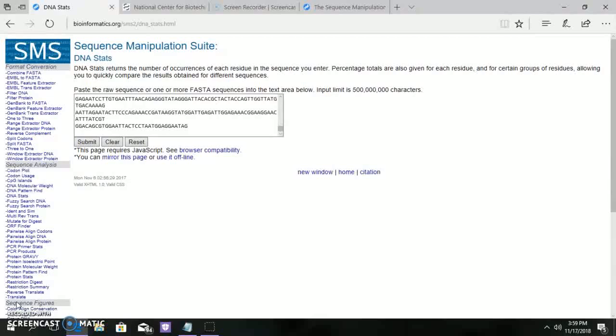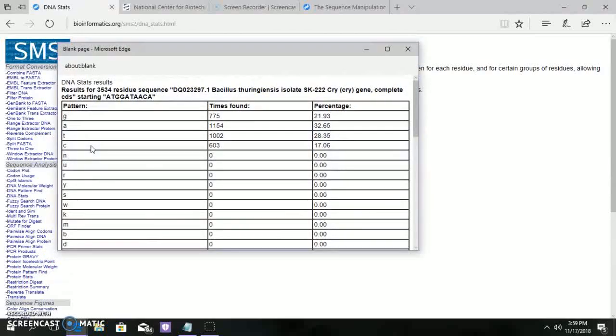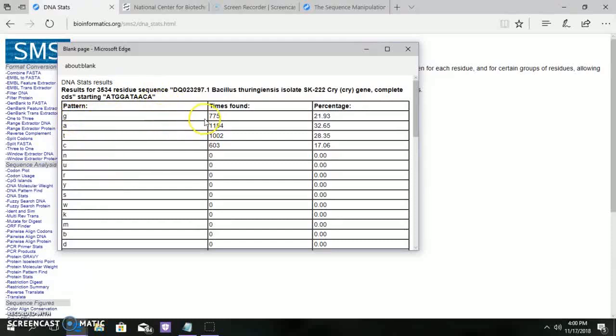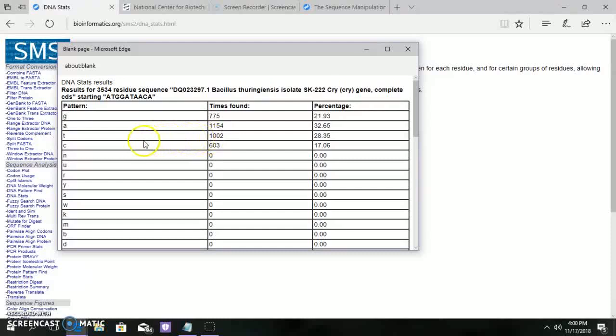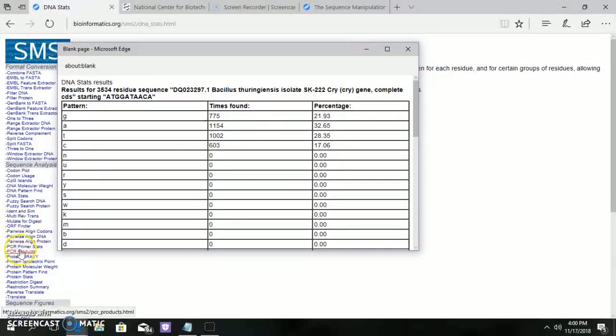Next, the DNA stat. This tells how many times the ATGC nucleotide base pairs are repeated. From the result page, we can infer that guanine is repeated 775 times, adenine is repeated 1154 times, thymine is repeated 1002 times, and cytosine is repeated 603 times in CRI gene. The percentage of the nucleotide present is given for ease of understanding.